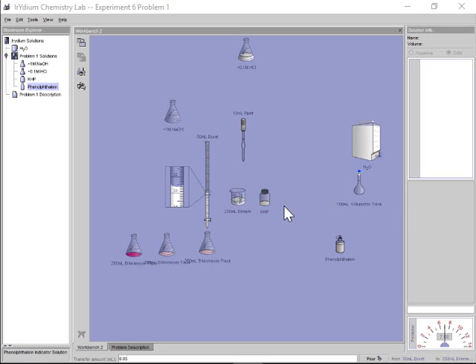Of course, in my correct way of making the solution, I first dissolved it in a beaker. You mash it up a little bit here. Just make sure it's less than the 100, that's the total volume of the volumetric. You transfer it in. You might find some residue left over in the beaker. Add in a little bit more water. Transfer those rinsings also into the volumetric.